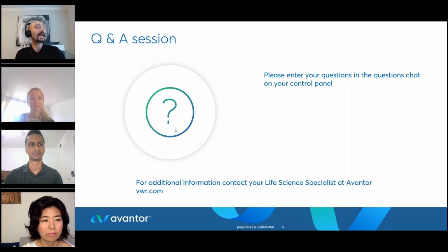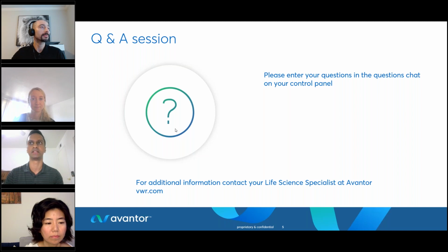Thank you. And Aaron, would you be able to comment on whether we are releasing more than 96 barcodes, so can multiplexing be done with more than 96 samples? As of right now, with the barcodes and indices we provide in the kit, the max is 96.